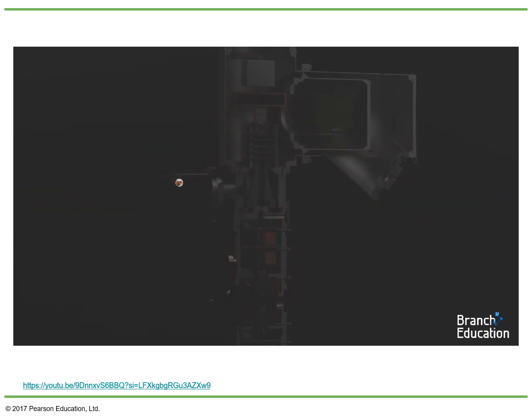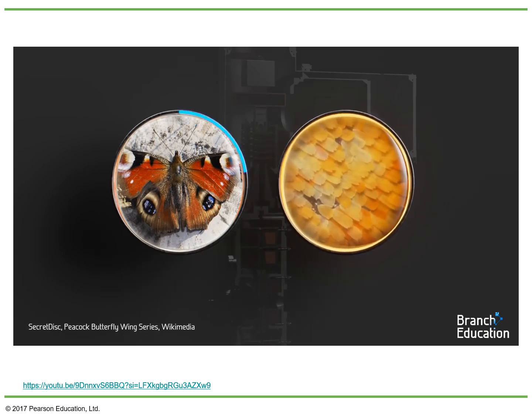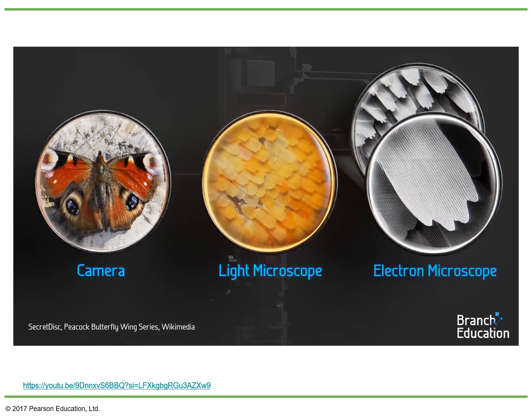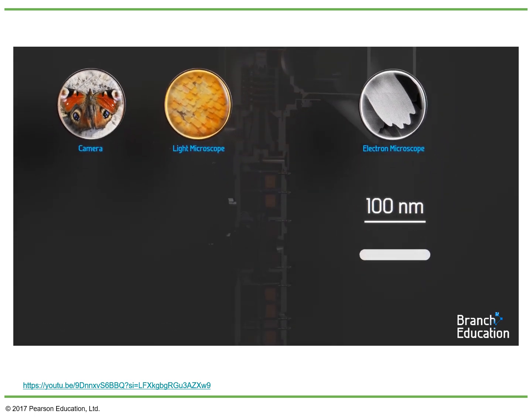Well, let's return to this image of the European peacock butterfly and the scales on its wings. This image was captured with a camera. This image was taken with a light microscope. And these images were captured with an electron microscope. Let's consider two features from the specimen that are only 100 nanometers apart.